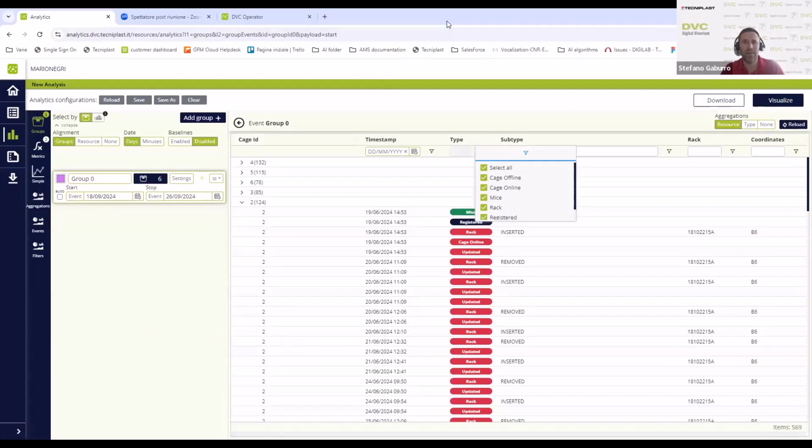If an animal is dying, they can be going crazy, while another strain can be completely not moving. So it depends really on the number of animals in the cage, when it happens, and when you see it. We have some algorithms that say that in 90% of the cases we can detect it if it happened during the night. But again, it doesn't tell you the mouse has died. It tells you there was a change in the activity.